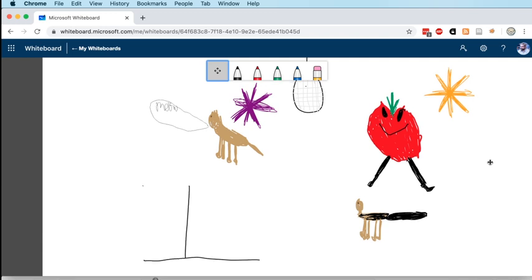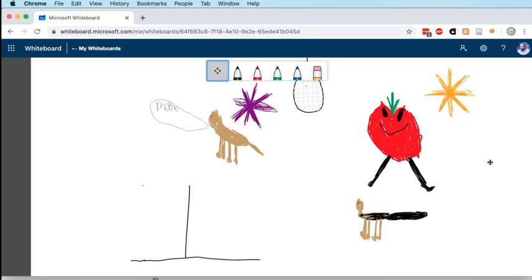The MA plot has log2 fold change on its y-axis, as we've already seen. The volcano plot has the log2 fold change on its x-axis. So you have this idea of how much a gene has changed on the x-axis. And then on the y-axis, we have an idea of how significant that change is.